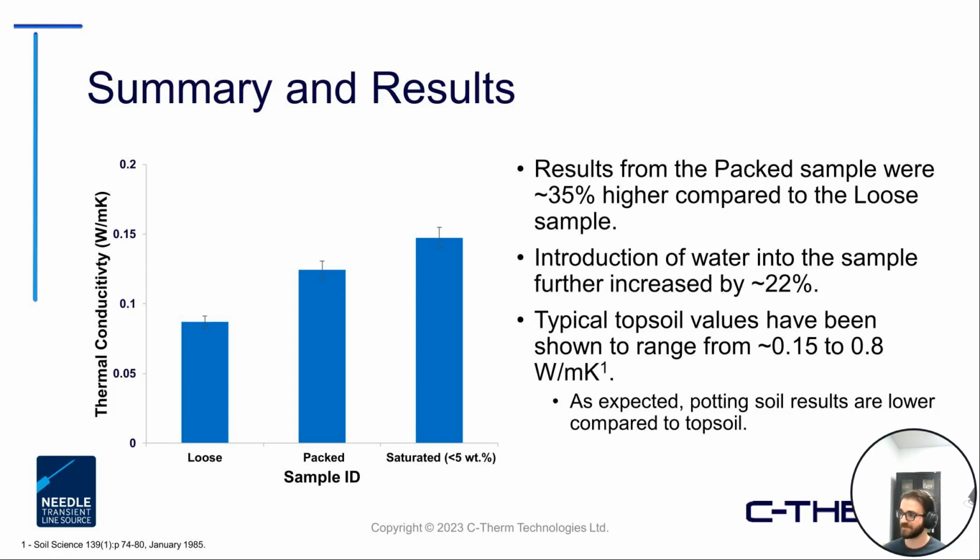What we're seeing here is that the probe being inserted previously into, let's say, the dry condition, any of those little air voids may be filled with just air and the material. Whereas if you're saturating it, perhaps you're getting some of those water molecules filling in that space, improving that heat transfer by effectively removing some of the evaluated air in that region. There are, of course, perhaps changes to the structural component of the organic materials that are in there as well, but this can have quite a synergistic effect as you modify these different conditions.